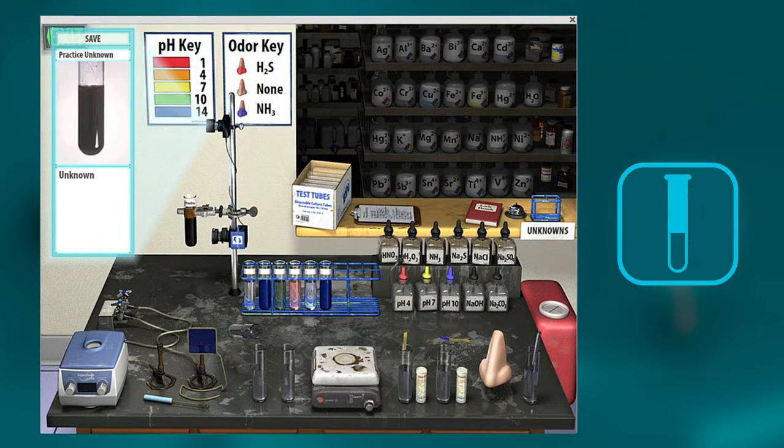Turn off the heat, add nitric acid, centrifuge, decant. Interesting. Okay, so I ended up with this solid again. What was that? Oh yeah, okay, I think I've got that. I remember what that test tells me. That was the cobalt test. And then this color, that color tells me directly what it is.